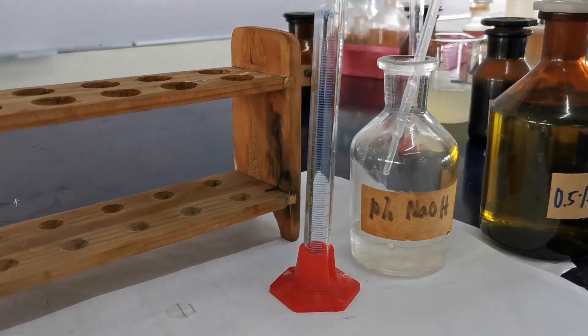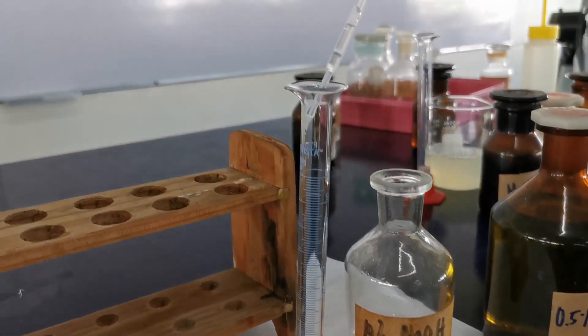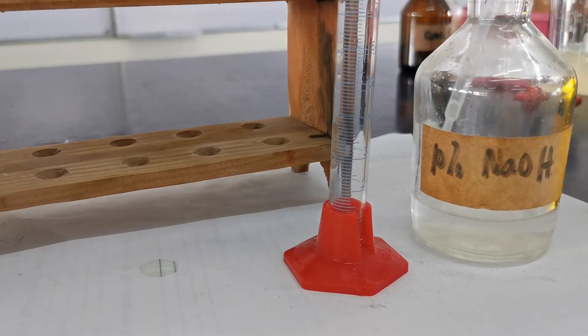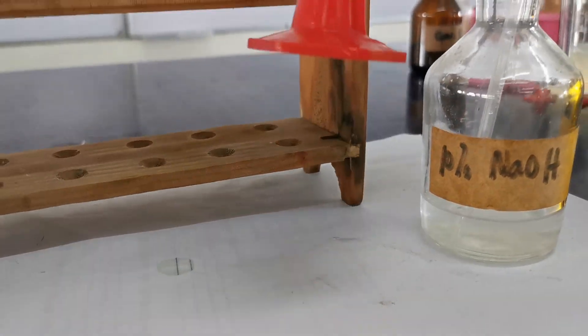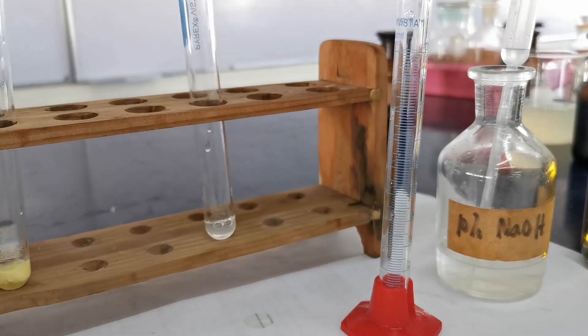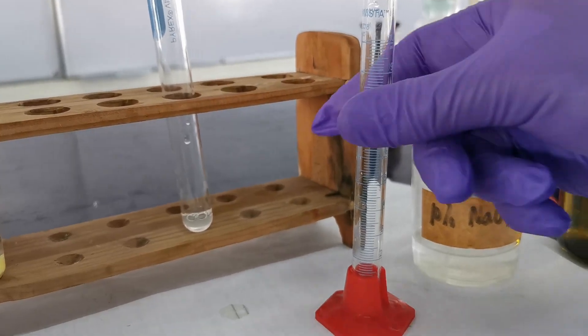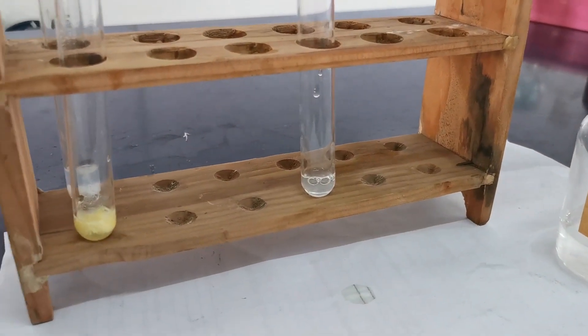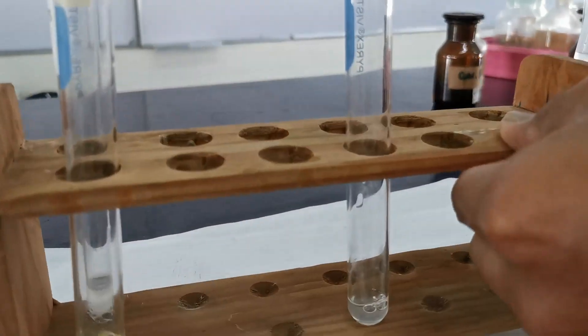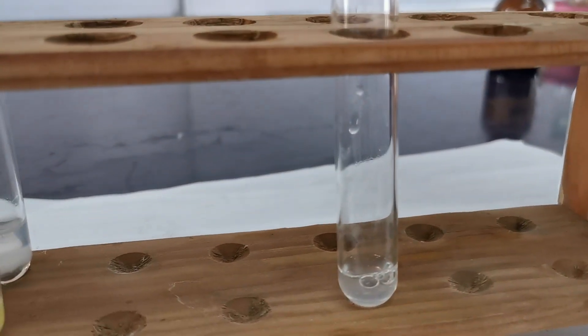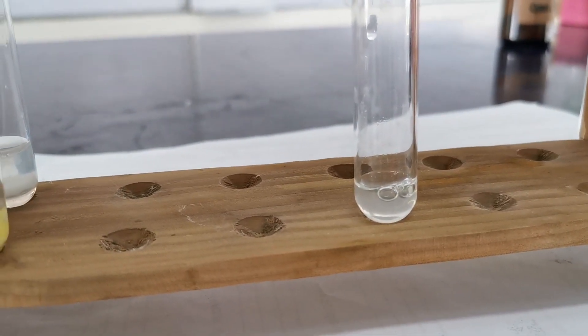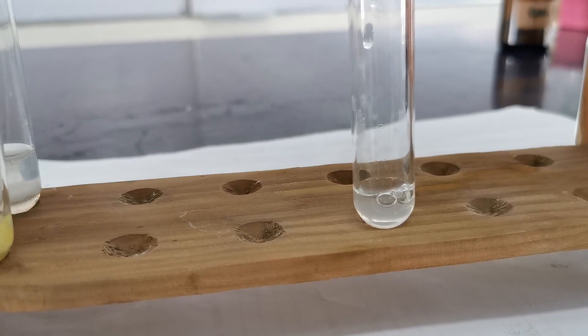Using the graduated cylinder, get 1 ml of egg albumin solution and 1 ml of 10% sodium hydroxide solution. Mix the two solutions.